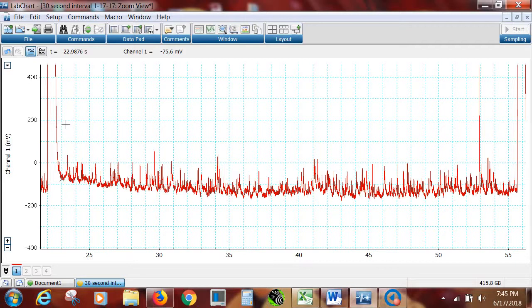22:98.76. Let me get a pen. Okay, so I'm going to write this down. 22.9, whoops, I hit the cursor, 98.76.